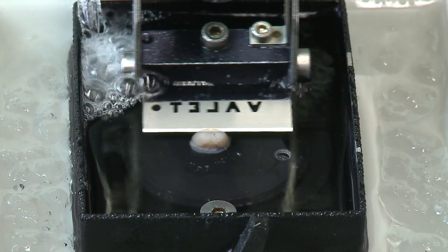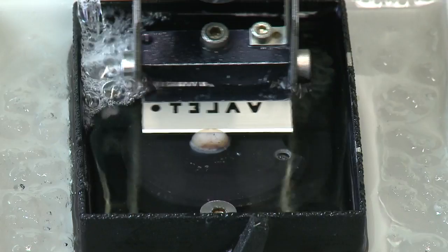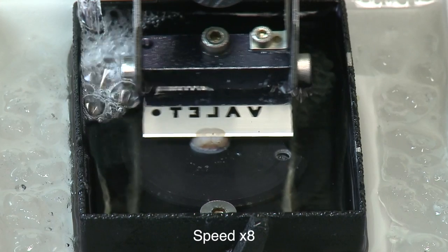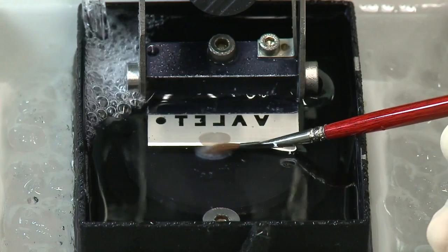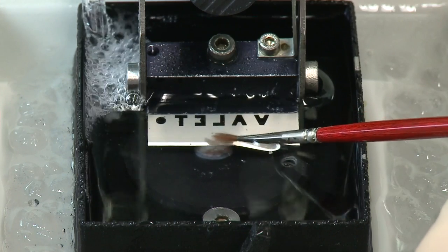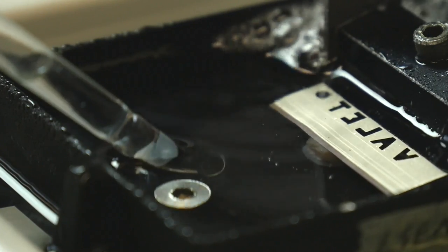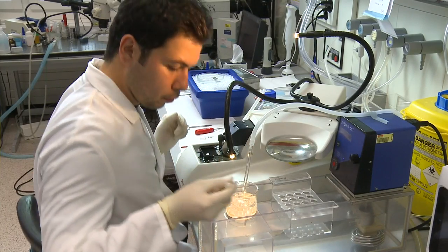We slice the brain with a vibrotome. It has a sharp blade which vibrates at 85 Hz and advances with a speed of 0.09 mm per second. The slices are 300 µm thick. When the blade reaches the end of the brain tissue, we gently push the slice towards the blade, separating it from the rest of the brain. Then we take the brain slice with a Pasteur pipette and transfer it to a chamber filled with 35°C warm sucrose slicing solution.